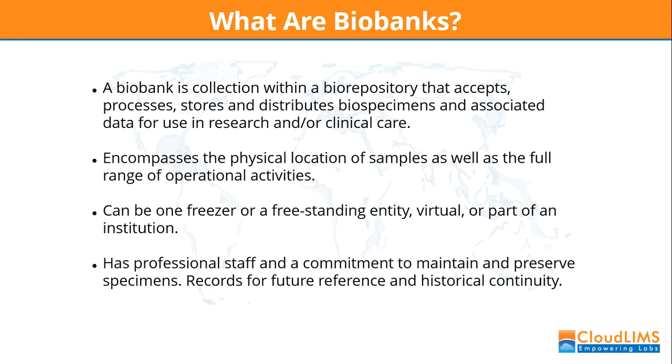A biorepository itself, or the collections of biobanks within it, can range in size from one freezer to an entire freestanding entity of a collection of rooms, perhaps a virtual biorepository that's spread out across an institution. Or indeed it's a bank that's part of an institution as a whole, and their entire collection is effectively part of that biobank.